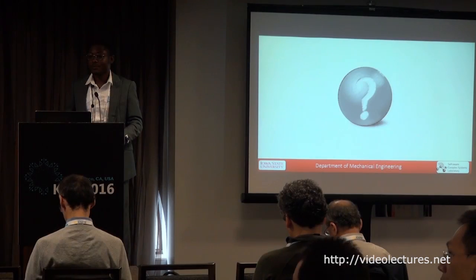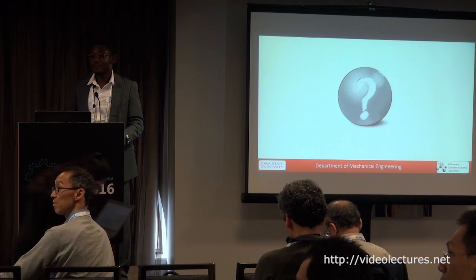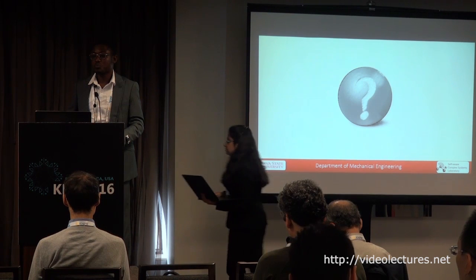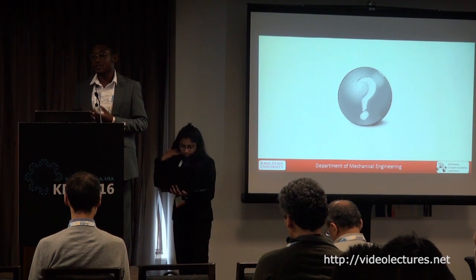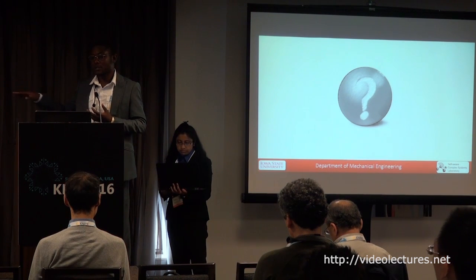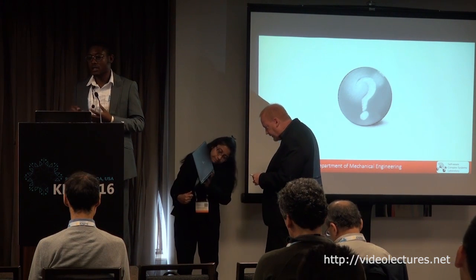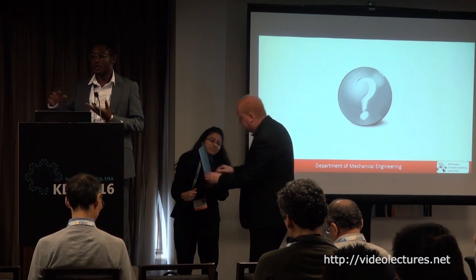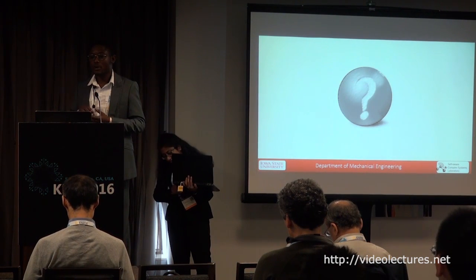You developed a method to count things from an image. How easy is it to make this method general to count any other thing in agriculture from that biological perspective? Well, I think it should be fairly easy to count objects which you're interested in. However, in this particular work, we have not included the counting stage. We did it just manually by looking after the detection. But with some algorithms which our colleagues in the lab have developed, it's fairly easy to do counting of foreground objects.